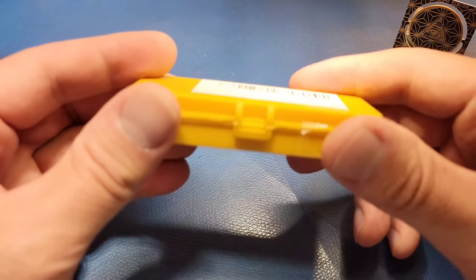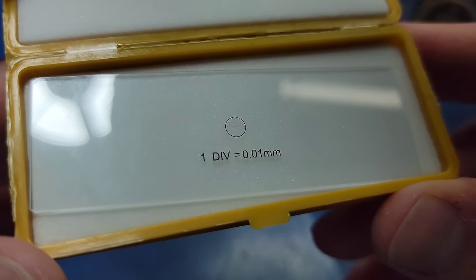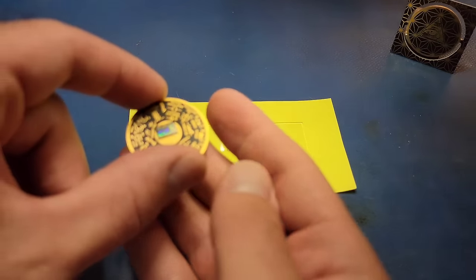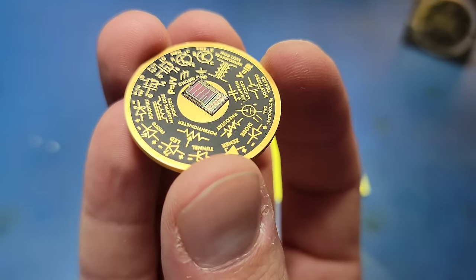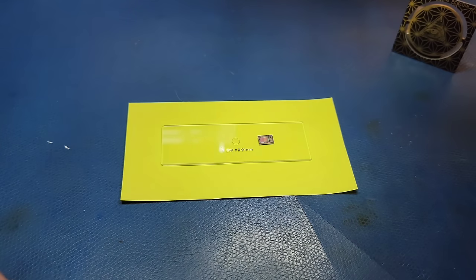In my mind the most critical aspect of a microscope is its magnification. I came up with two tests to evaluate each microscope. In the first test I'll use a microscope calibration slide and take a photo at maximum magnification. In the second test I'll look at a silicon chip with each microscope, again at maximum magnification. I'll be using my two optical microscopes as the control group to compare against.